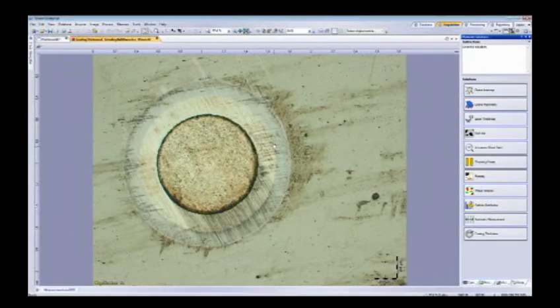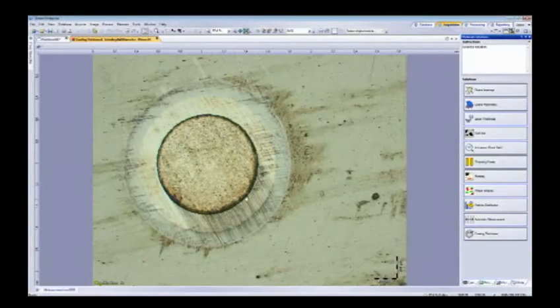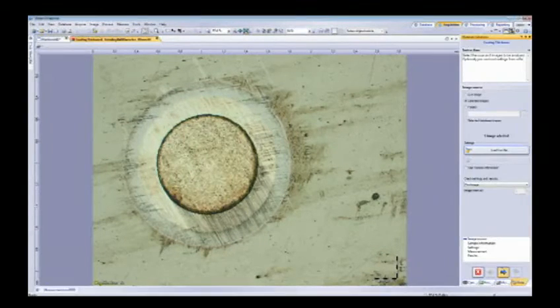Let me go back to, you wanted to cover the coating thickness? Yeah, the coating thickness. I have an image here real quick. I'll load. So this is an example of a surface that's been used a grinding ball of a certain diameter, grinds through the coatings. And this one has 2 individual coatings you can see here with the bands. We can measure this thickness since we know the exact diameter of the grinding ball and how many coatings we have. So we'll go into that module. So I can see there's like an outer ring that's kind of a lightish gray color, and then an inner ring, and then you've got the actual base material.